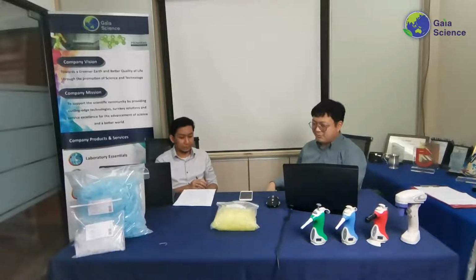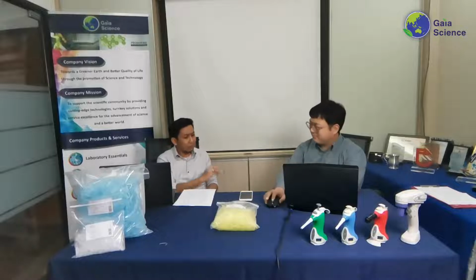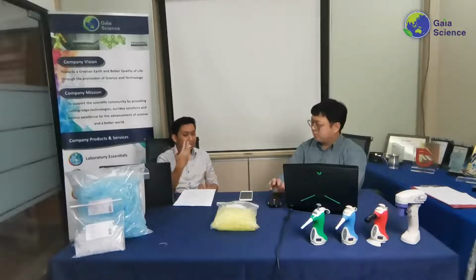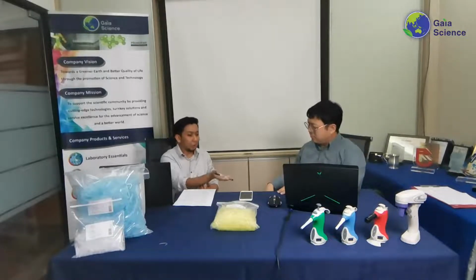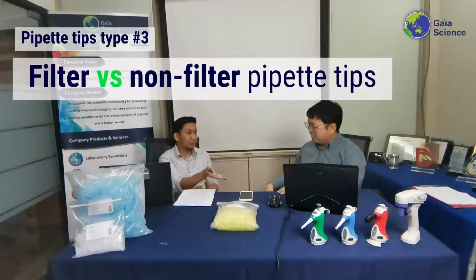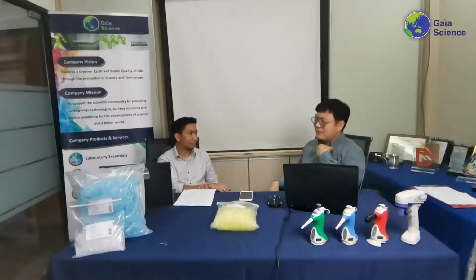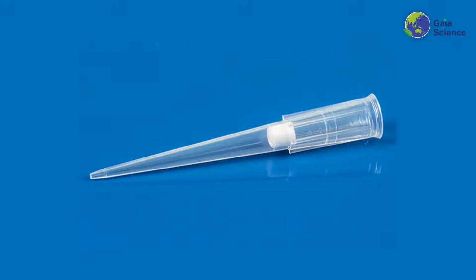I see. Definitely. Yeah. But talking about autoclave, there's a myth where people say that you cannot autoclave filtered tips, and if you want to use filtered tips, you have to get them from the manufacturer. But talking about filtered tips, what are the differences between normal pipette tips and the filtered ones? Okay, good question. Yeah, that's one of the things I also get a lot of questions about, because you might have bulk and then filtered and then sterile filtered.